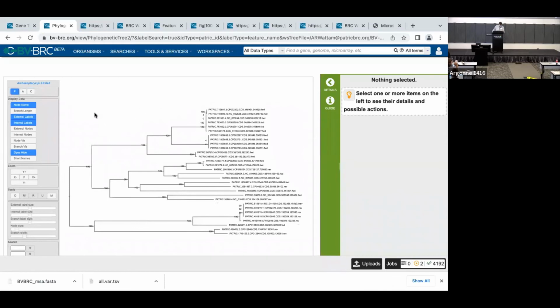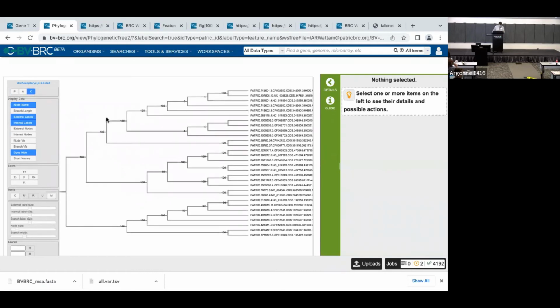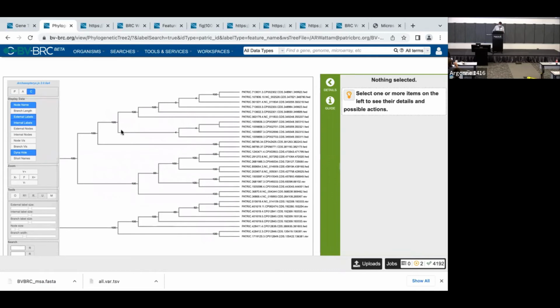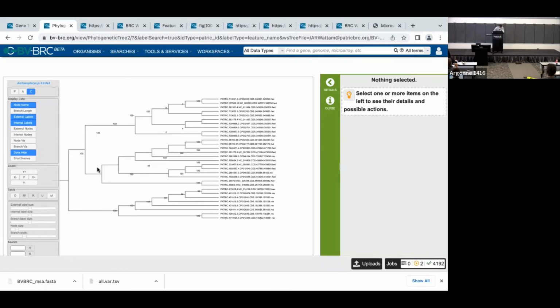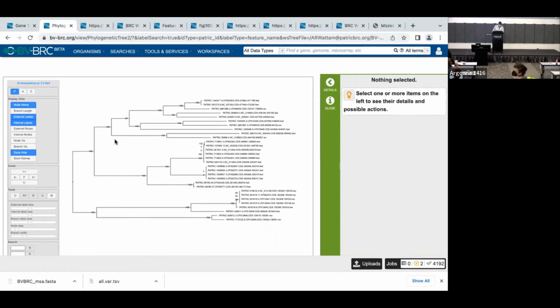Oh, and if I was in that view, because this is something that often confounds me, especially when the branch lengths are very short, could I rearrange the order using this where I can actually capture those branches and then have it preserve that when it goes back to the phylogram, which is what I actually want? You mean you want to switch them like this? Yeah, let's say I wanted to switch that. And then I want it to look like that. Now click phylogram. And if it's the same, yes, oh, it kept that tree. Okay. Any mean thing I have ever said about this, I take it back, because that's something I really like.